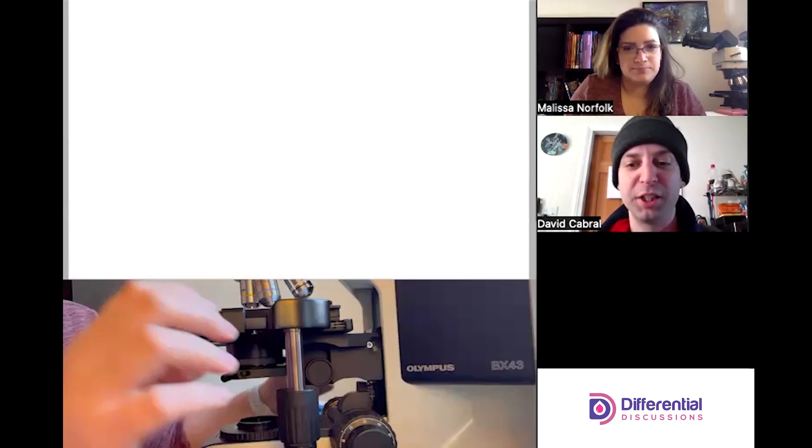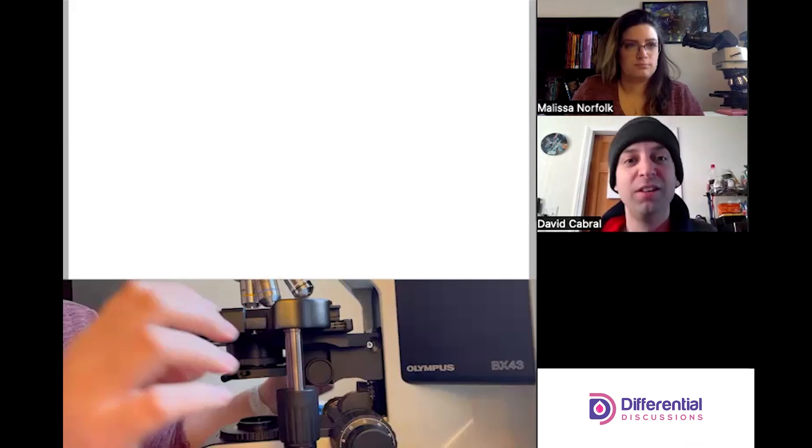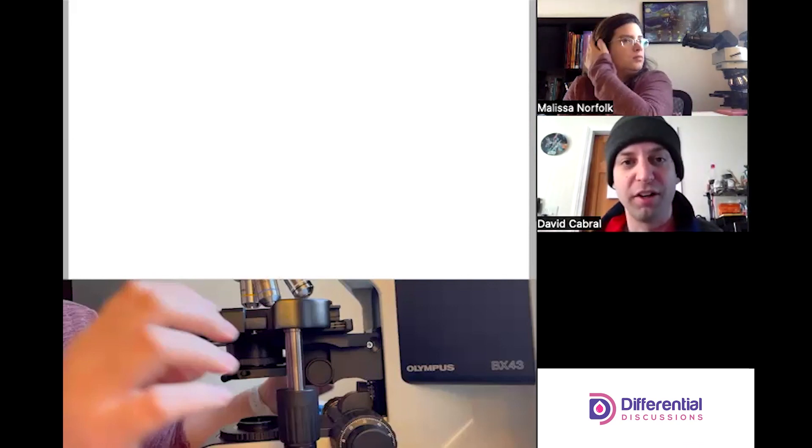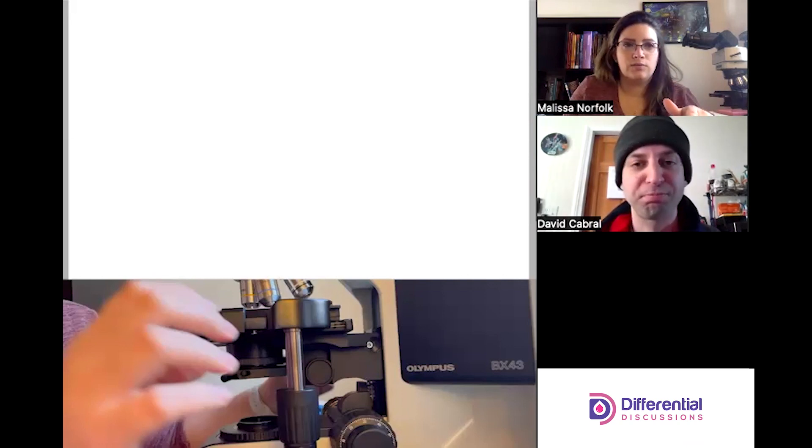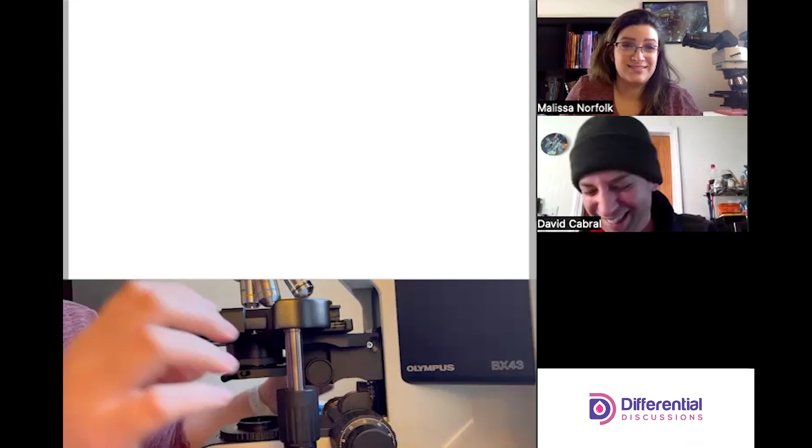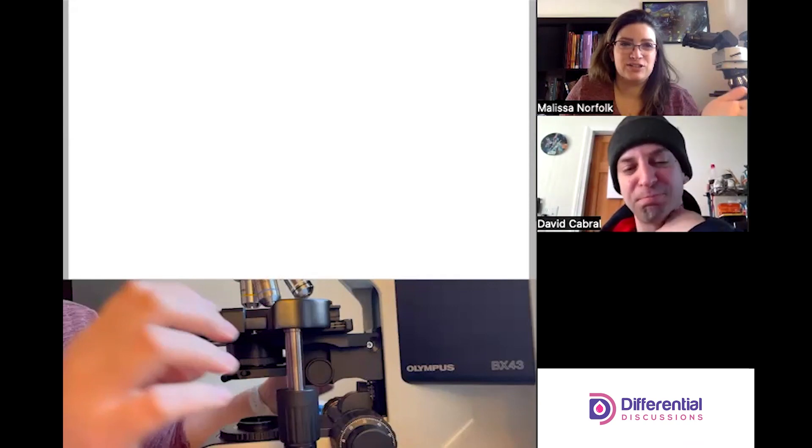This is about setting our tool up—in this case the microscope—the appropriate way for maximum performance. In my experience, I've encountered lots of people who maybe don't even know how to Kohler this scope if they had to. Most scopes are like close enough, but we're not in for close enough, we're in for perfection. I think that goes for students, new laboratorians, and experienced laboratorians because I think we've met all three that have no idea what Kohler is.